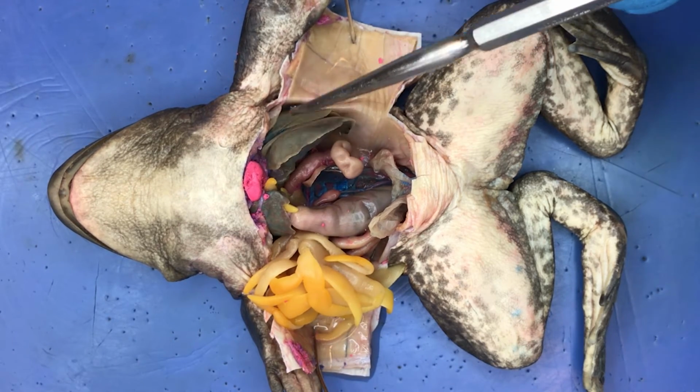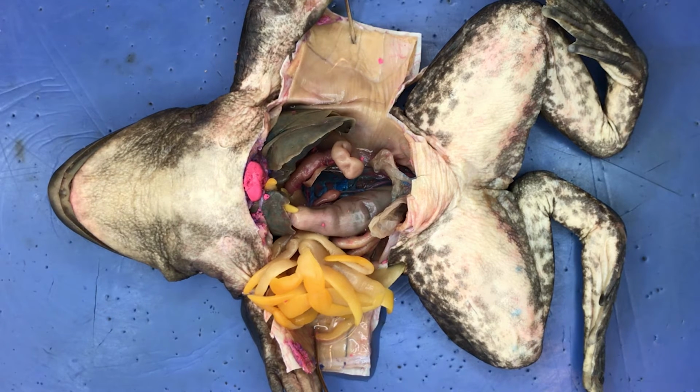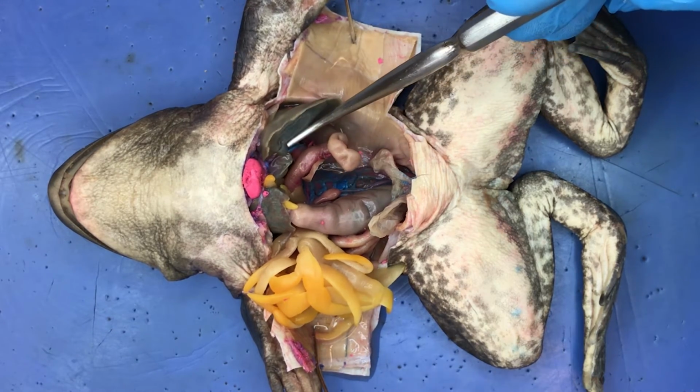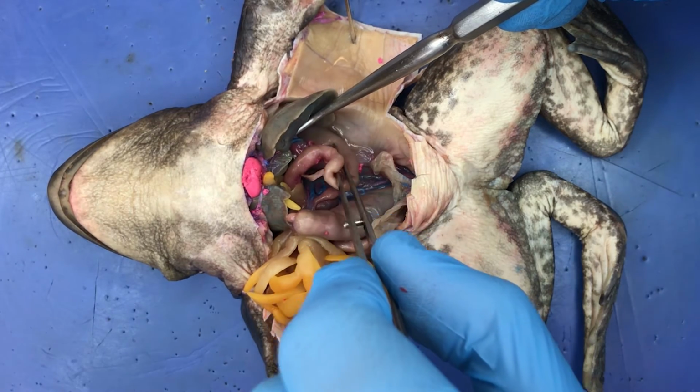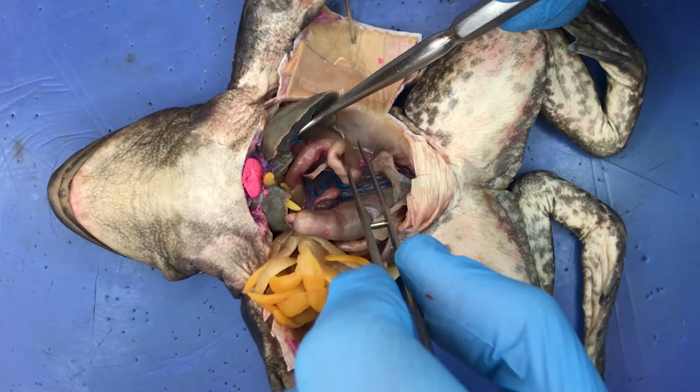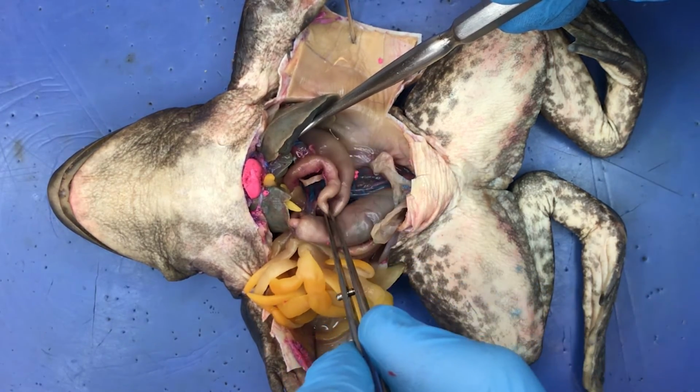The gallbladder empties into the elongate bile duct. A short esophagus lies just dorsal to the base of the liver. That esophagus leads to a larger, tubular stomach. The stomach is J-shaped, curving towards the animal's right side.